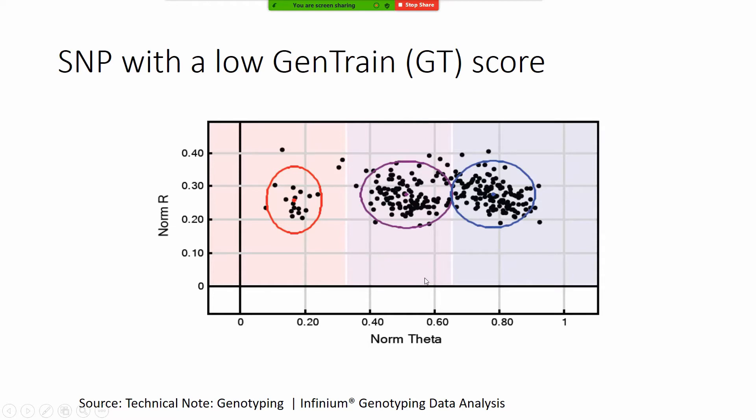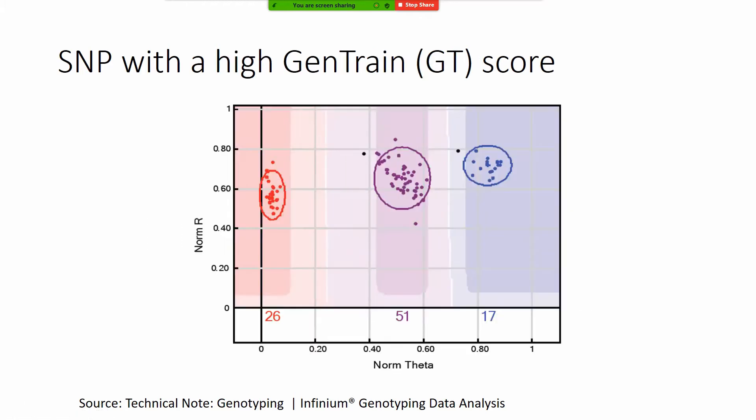Low gene train scores are basically meaning faulty SNPs similar like this. So basically when these clusters or ovals are too close to each other the SNP is quite useless so it gets a low gene train score. And there are some other SNPs which are quite good and well separated so they get a high gene train score or GT score.